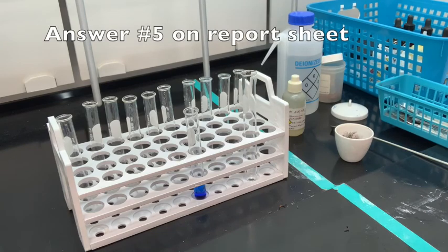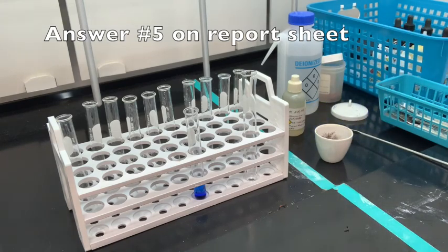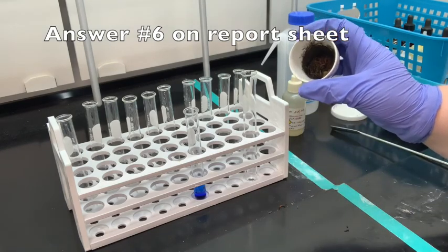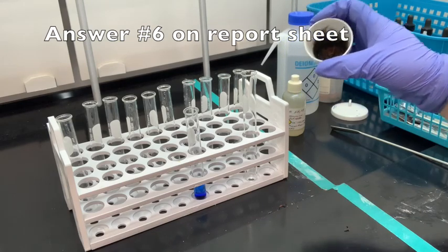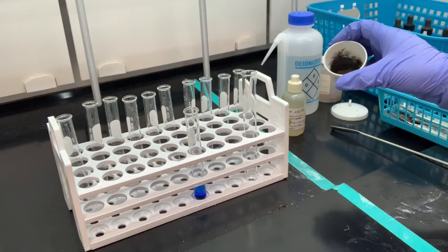Thinking about the questions that you need to answer. Does this copper sulfide product react with ammonia? Yes or no? Then number 6, you want to suggest a formula for the stuff inside the crucible, this copper sulfide compound. Is this copper sulfide copper 1 sulfide or copper 2 sulfide?